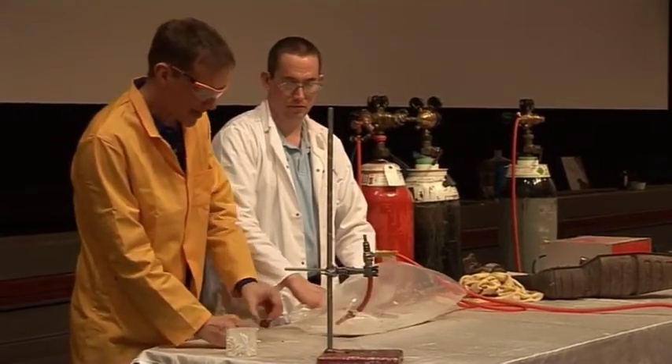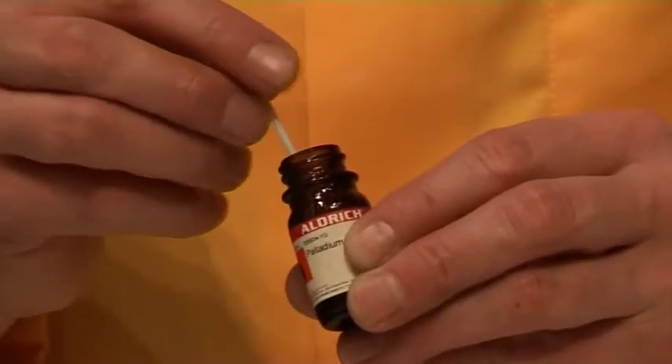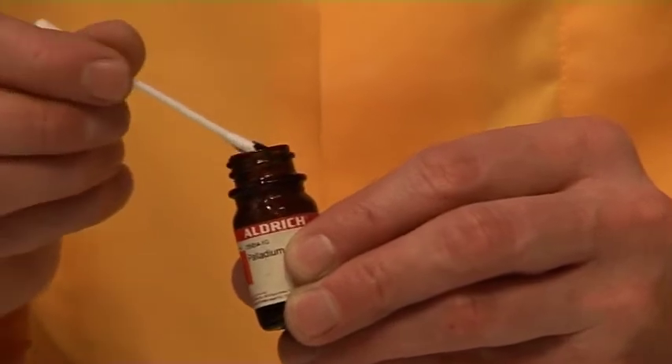This time what I'm going to do is see if we can light it a slightly different way, and I have some metal catalyst here. This is palladium metal, very finely divided palladium metal.